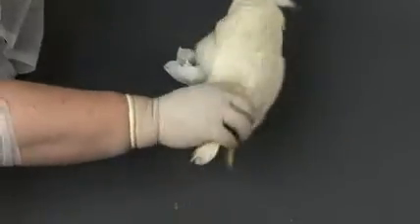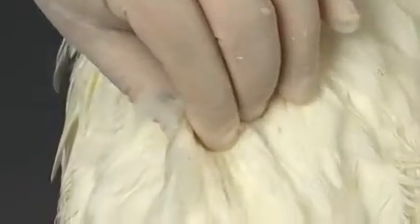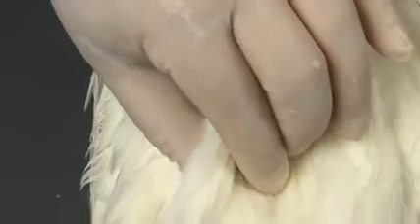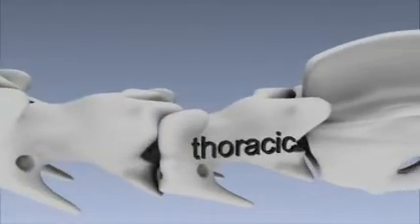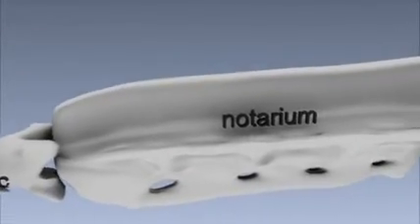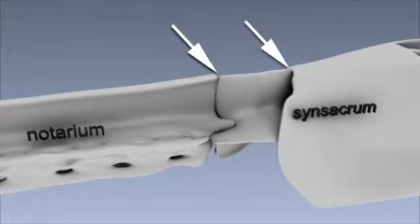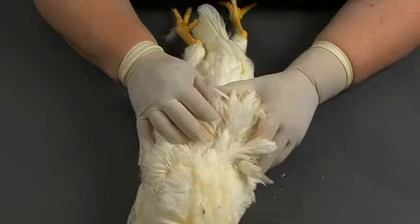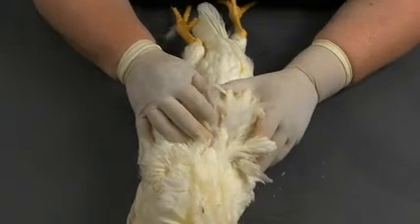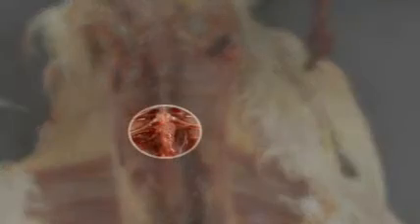Turn the bird over and palpate the vertebral column, feeling for fractures and developmental defects such as spondylolisthesis, often referred to as kinky back. The vertebrae in birds are largely fused, and there should be little flexibility along the back. There are one or two free vertebrae located between the notarium and the synsacrum. Palpate this area carefully for fractures or deviations. This area can be examined more carefully from the ventral aspect once the bird has been opened and the viscera removed.